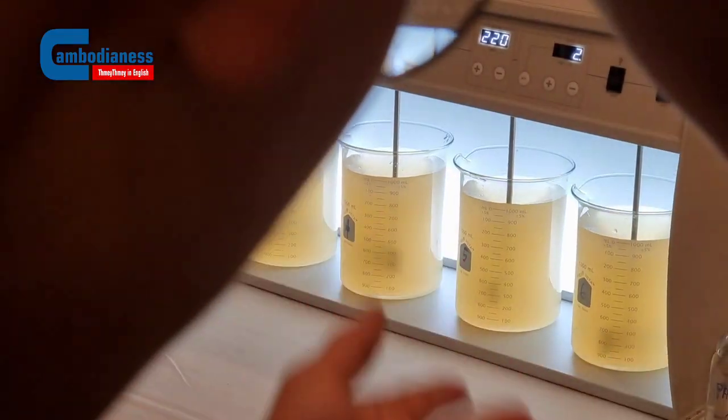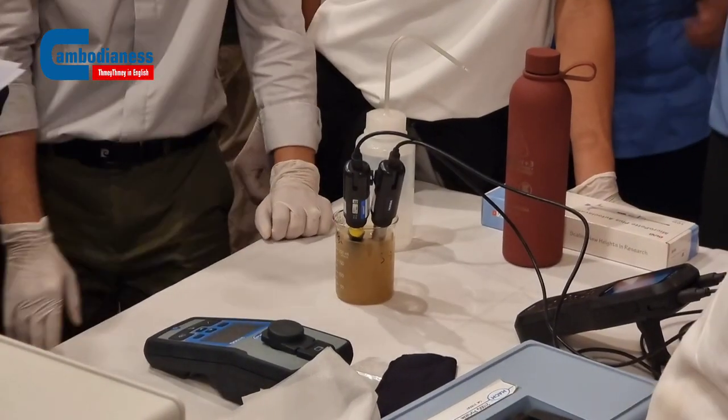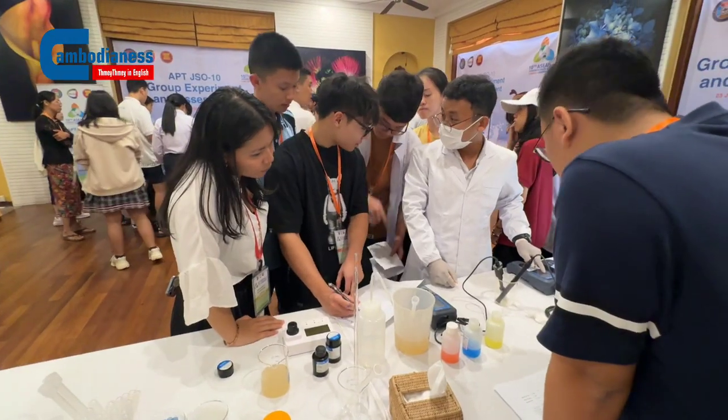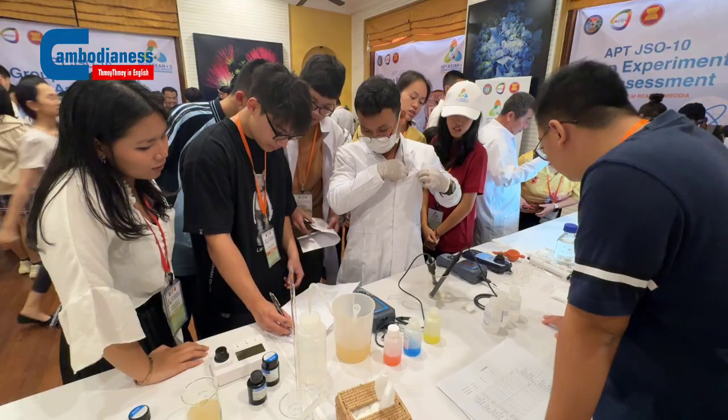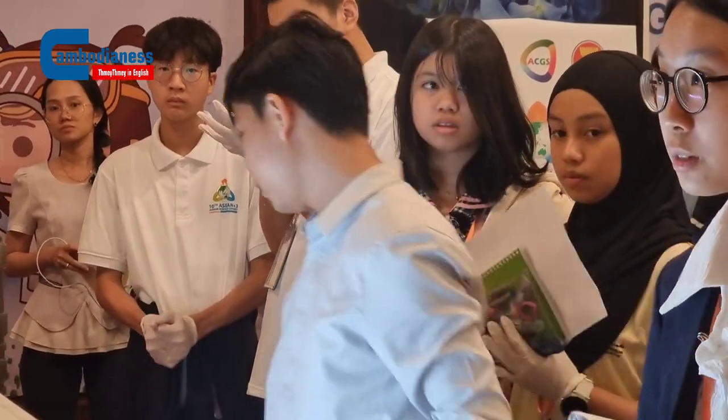We just saw a lot of lab equipment — the studying machine, the measuring machine, and many glass instruments. Many of the students are coming here to see how we clean the water. Sir, can you tell us a bit about how the cleaning process works?